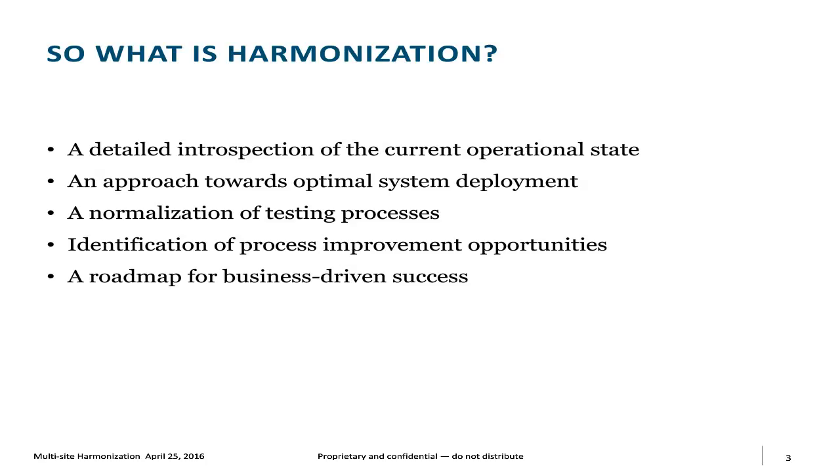Back in the days, as I mentioned, with Digital Equipment Corporation, when we were forced to develop this strategy, we coined the words as-is and to-be, but in parallel with other organizations in workflow analysis and so forth, they just seemed like logical terms to use. But we did use them in presentations as far back as the late 1980s, around 1987 or 88. A look at the as-is environment, the current state system, is necessary because it's sort of a barometer of where you want to be. We're going to see detailed examples of workflow and the way we target system functionality for LIMS deployment in just a few minutes here.